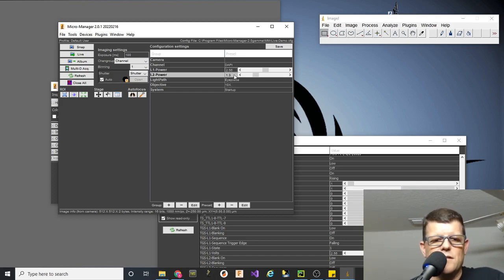Again, this kind of assumes a 4-line system. This assumes that each of your lines has a voltage input, and it also has a TTL input for on-off state. Now, most LEDs do, most lasers do, and there's nothing wrong with running it this way. There's also nothing wrong with, say, you have a laser that has a power level control using a proprietary software package. Many lasers will do that, and then you might want to control on-off states, and they'll offer an on-off TTL input, but the power state will be through USB.